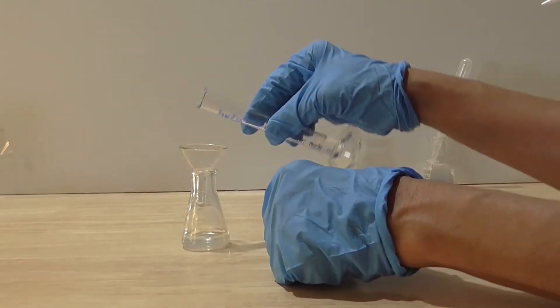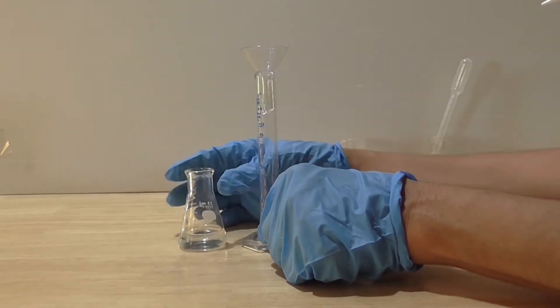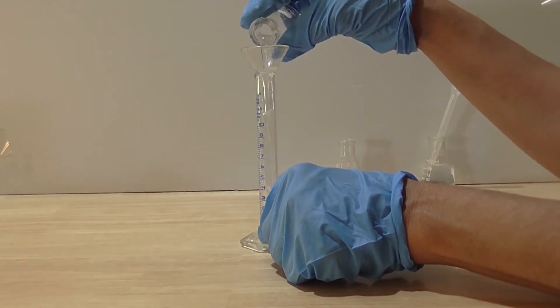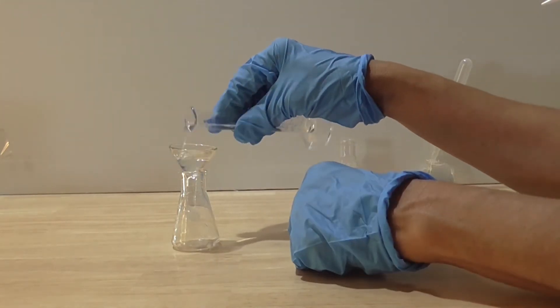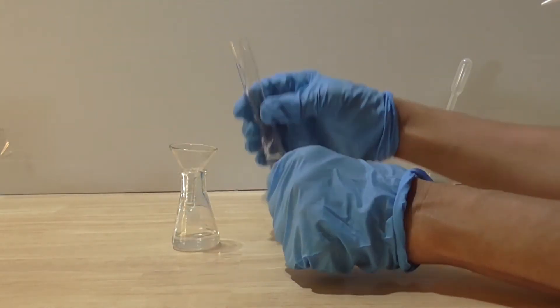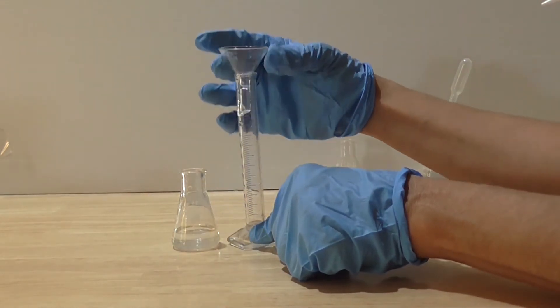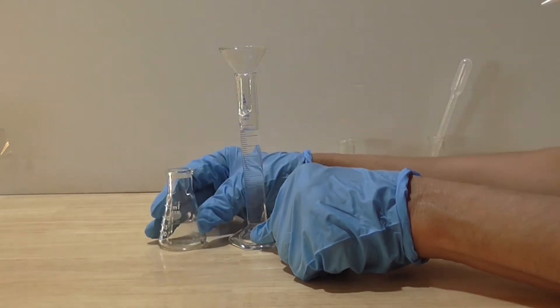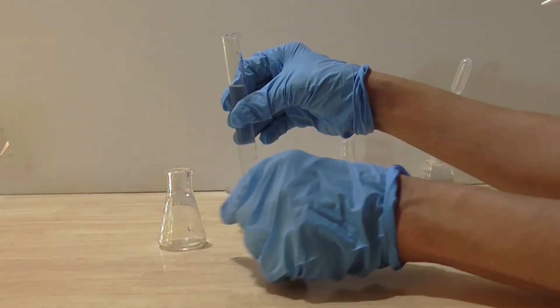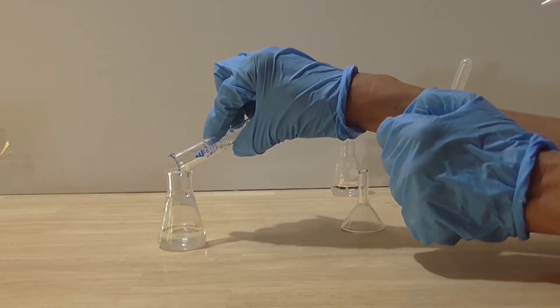I need to ensure it is well mixed. Hence, I transfer it from one glass vessel into another a few times. I now have hydrochloric acid that is 0.01 molar, and I am ready to proceed with my next dilution.